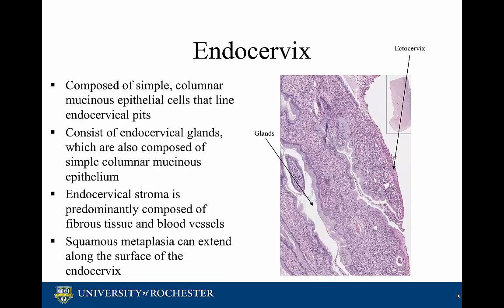The endocervix is composed of simple columnar mucinous epithelial cells that line the endocervical pits. The endocervix also has glands composed of simple columnar mucinous epithelial cells. The endocervical stroma is predominantly composed of fibrous tissue and blood vessels. It is also important to note that squamous metaplasia of the transformation zone can extend along the surface of the endocervix.